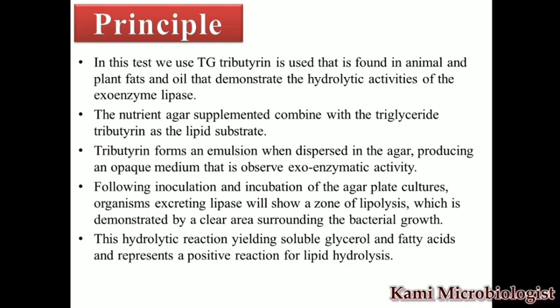It will be observed around the bacterial growth. When we get the hydrolytic reaction, what does it mean? It means that it is the positive reaction, and during this hydrolytic reaction we get glycerol as well as fatty acid. So this is the principle of the test.